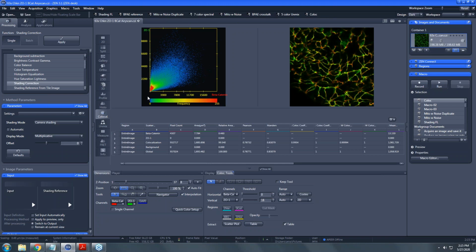The concept is that if we have colocalization, we should see some correlation between these two. So we're going to have some population of pixels that have both fluorophores in them, and two fluorophores in one pixel means that we have intensity for both channels, and so we get a line that travels at kind of a 45-degree angle in this scatter plot. If we didn't have any colocalization or we had an exclusion of it, then we would see two distinct lines going along the axes, which means there's no coincident stain. We have a measurement of that though.